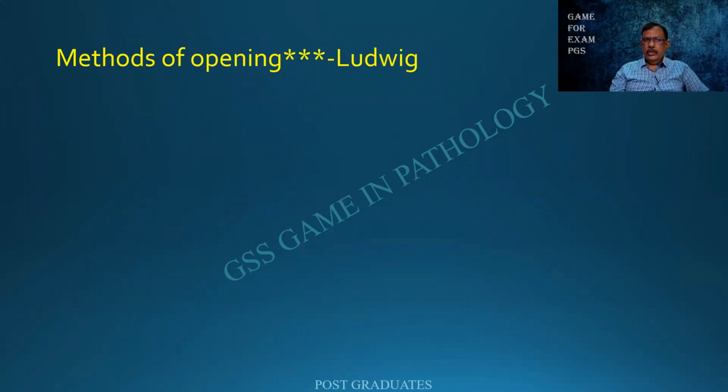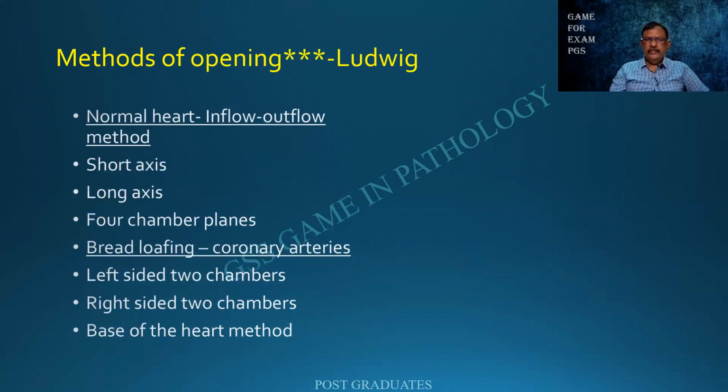Now, there is a difference between the method of opening the heart and the method of removing the heart. They are two different things. Obviously, we will open the heart after it has been removed. Look at this one. It is not a simple answer. There is an entire plethora of lists, which I would like you people to kindly learn by heart. By heart, there is no other word. Is it clear? So these are the different methods.